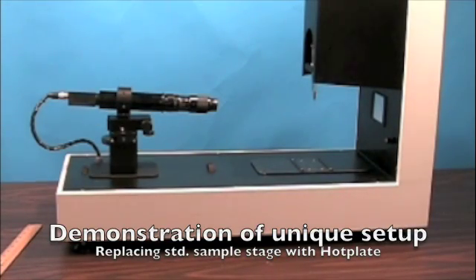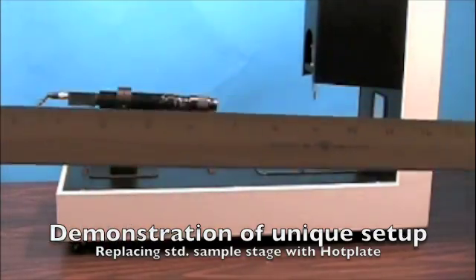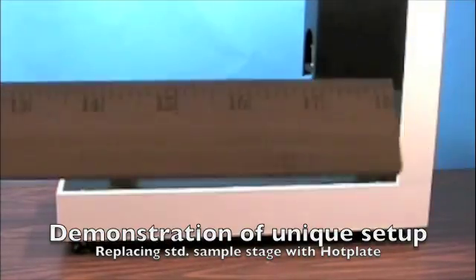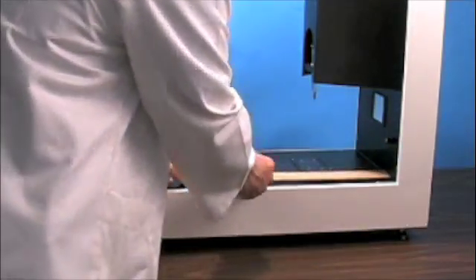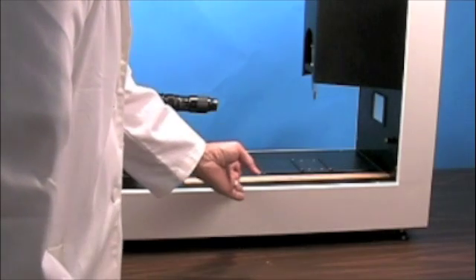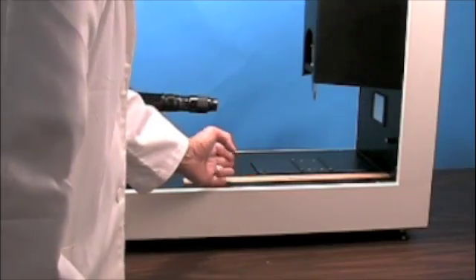This is the contact angle analyzer, the Phoenix 300 Plus. From a distance perspective, we have a ruler here that's 18 inches, and we definitely have at least a good 15 inches from here to here.